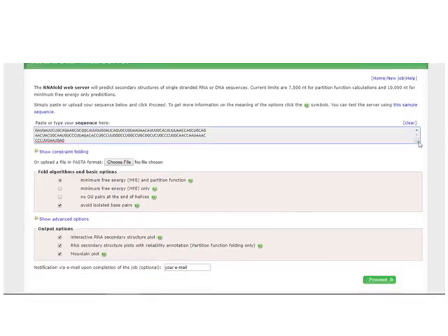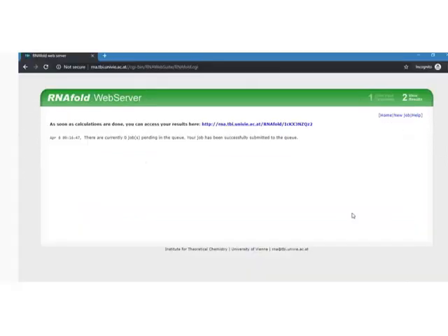So basically, in the next slide, we are just copying and pasting the sequence of the RNA of interest in the right place, and then we hit proceed. As soon as calculations are done, we can access our results on this website. I will go through all the steps in detail, because we need to adjust a lot of things, but this is in general.